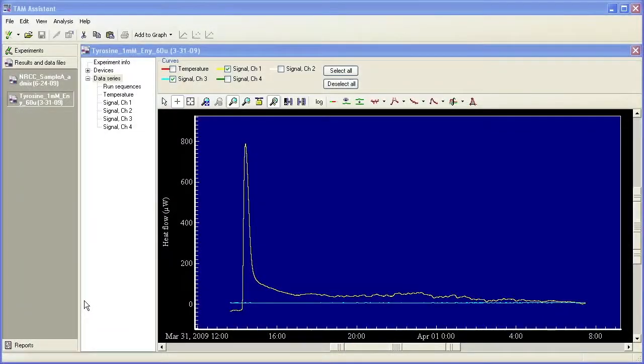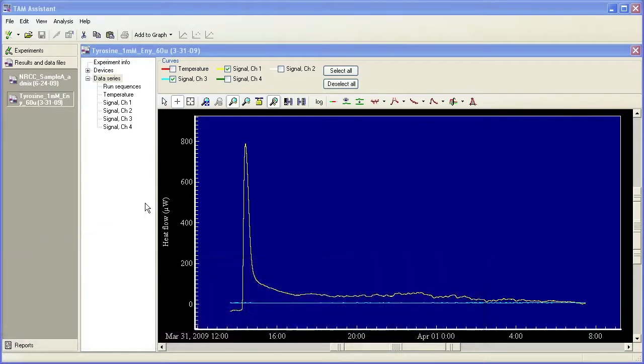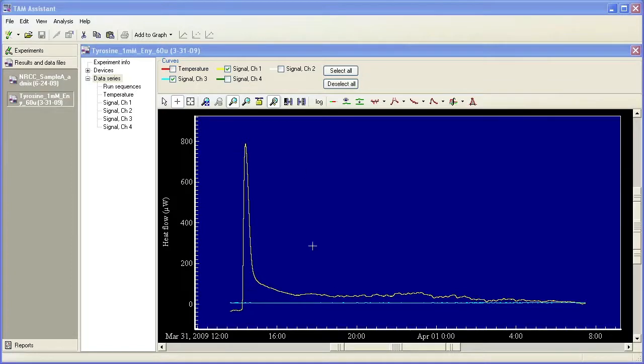In this TA Tech Tip, I'll show you how to create a report and overlay plots using TAM Assistant software. So in this first plot, I want to show you how to overlay these two curves.